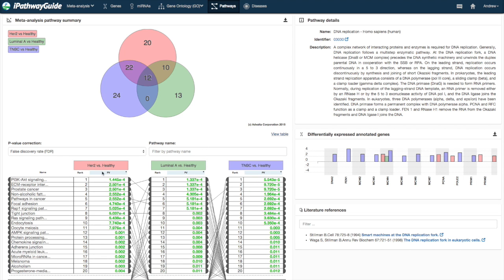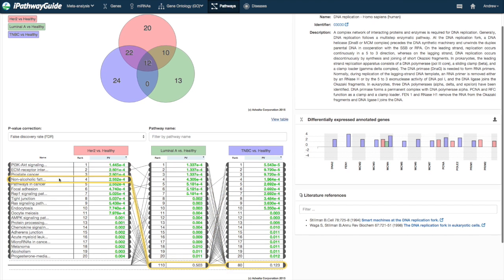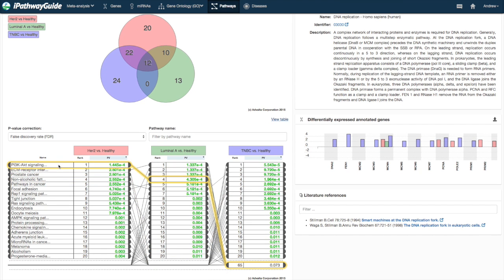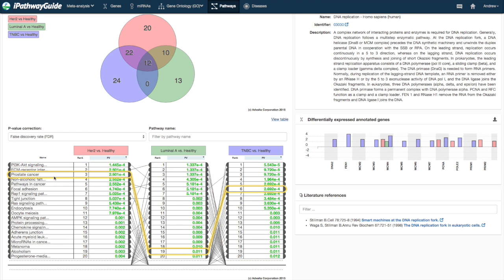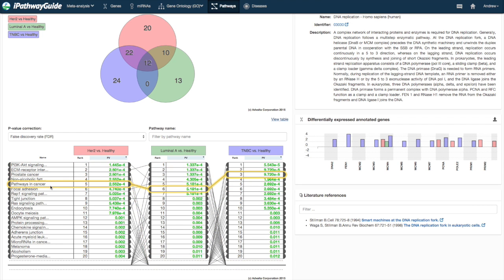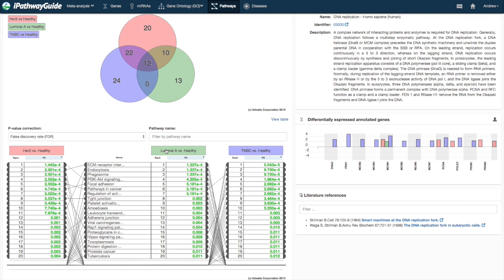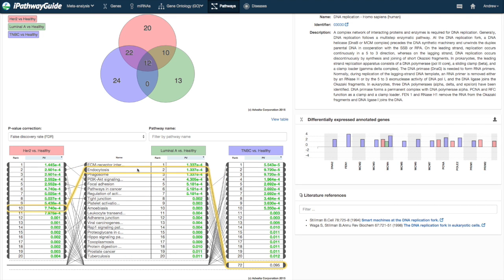For example, in this data set of three breast cancer types—HER2, luminal A, and triple negative—we can see the relative ranking of the pathways between the types. We can also change the focus of the rankings by clicking on the heading of the contrast we want to focus on.